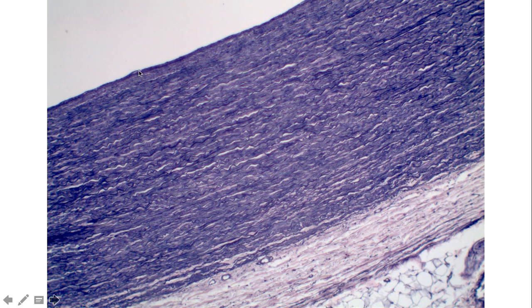And so if we could look very closely, we'd see a thin layer here, the tunica interna, followed by then a very thick tunica media. Now the big difference that we see here is that the tunica media is actually predominantly elastic fibers, and there's also going to be some collagen fibers in there. And so smooth muscle is not the primary tissue that you find in the tunica media in this case. It's going to be these elastic fibers and collagen, and that's what's going to allow these to have this nice elastic property, which is very important.